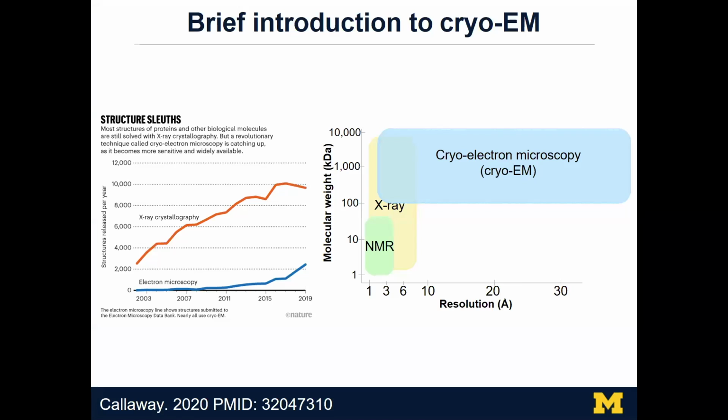So cryo-EM is a technique for structural determination of biomolecules without crystallization. And it's growing very fast, especially in the recent 5-6 years. And it has started to invade the space of X-ray crystallography, by moving to solve structures for smaller molecules, like below 100 kDa, and it can currently reach higher resolution. So it's started to reach true atomic resolution in the last year.